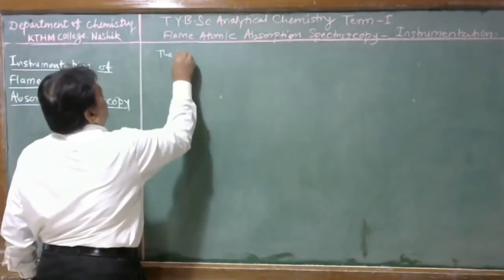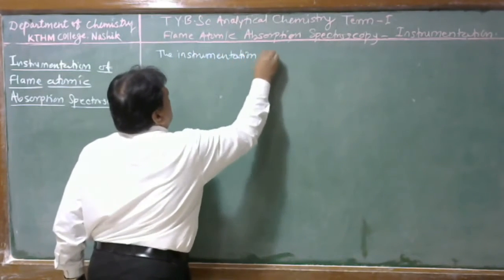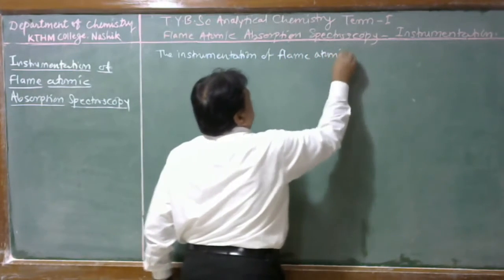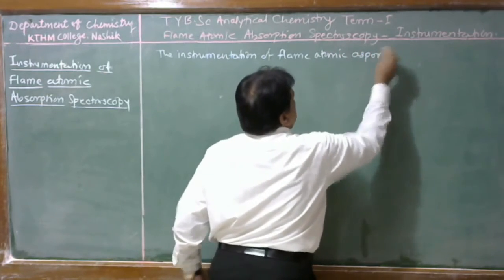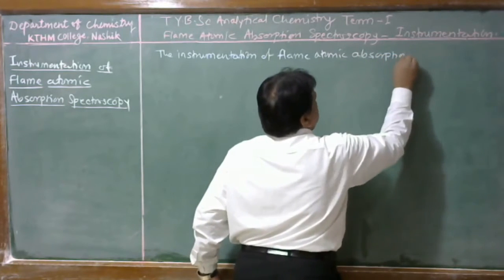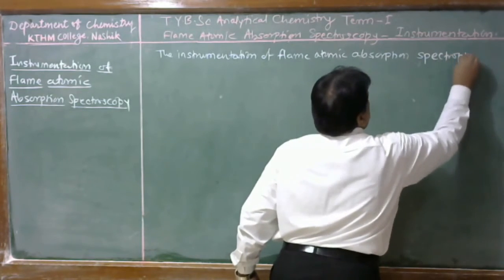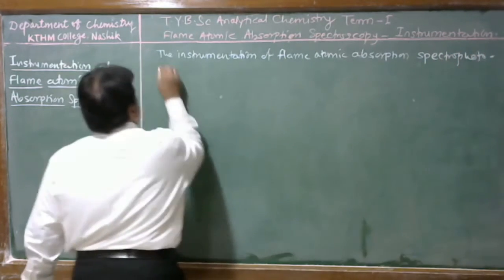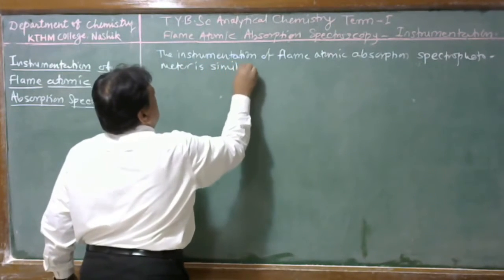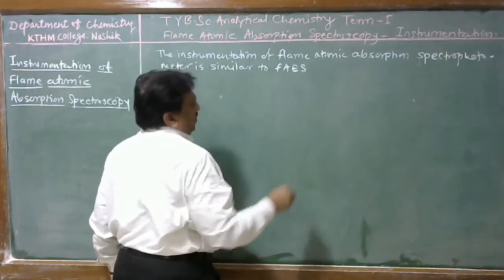The instrumentation of flame atomic absorption spectrophotometer is similar to flame atomic emission spectrophotometer.